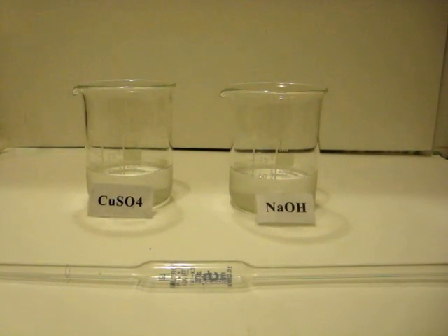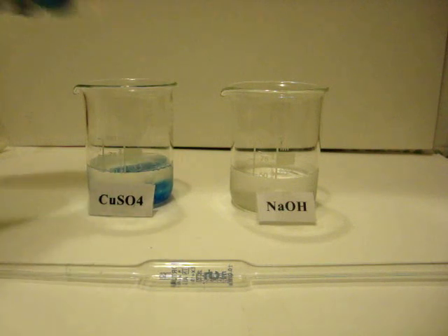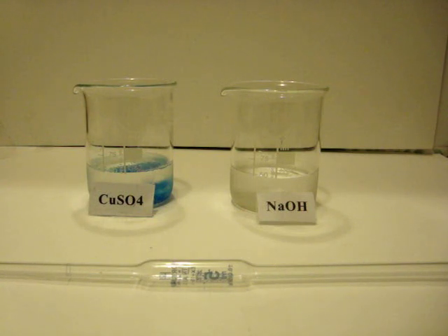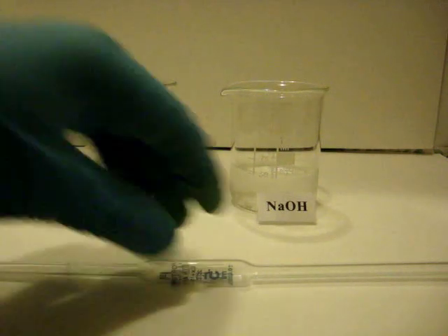Let's start with two solutions of very cold distilled water, about 60 mL for each beaker. In the first one on the left, put about 8 grams of copper sulfate pentahydrate. While in the second one on the right, 4 grams of anhydrous sodium hydroxide. Now mix until both are completely dissolved.